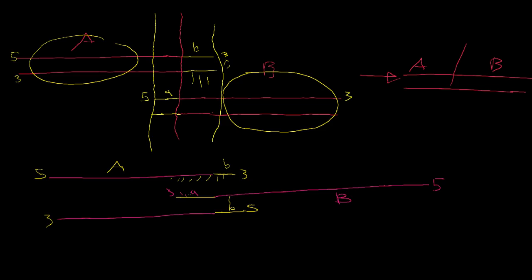And it's kind of, here's our DNA. So now you can see that we've taken this strand. So let me change colors real quick. We've taken our strand A, our capital A, with our little b. We've taken that 5' to 3' fragment, and it's come down here as a single strand.